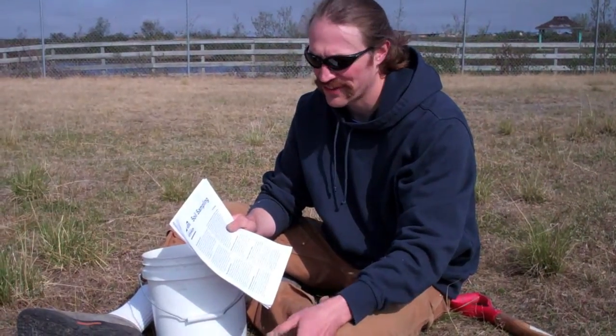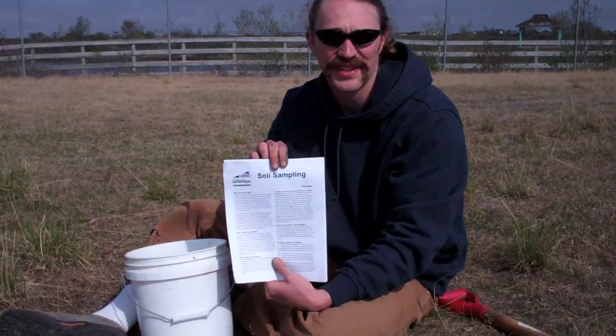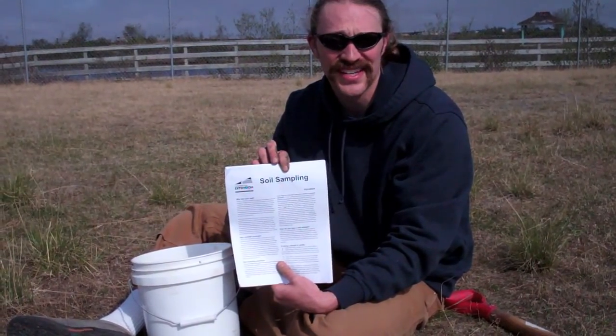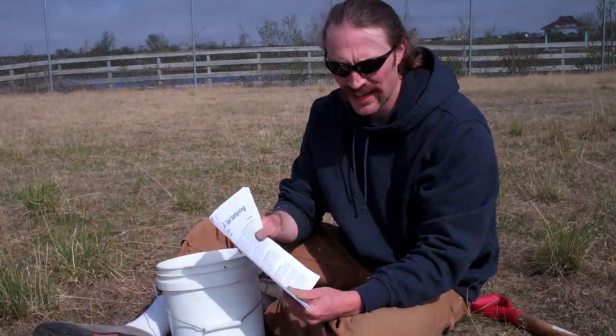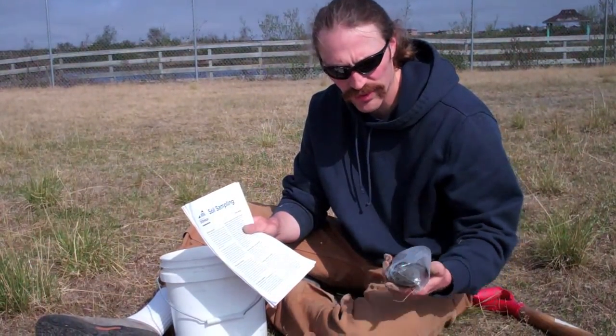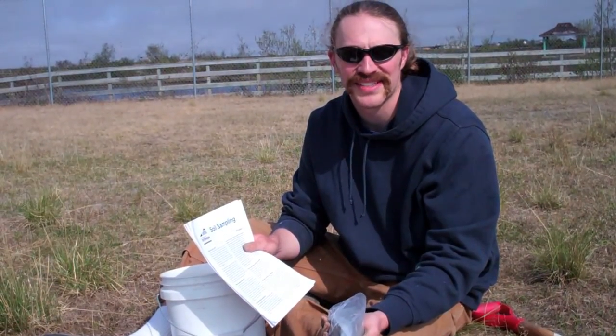A lot of the information that I got for this came straight out of our Cooperative Extension soil sampling publication. So if you can't remember it all, we've got this available online or from your local extension agent, and it lays it out pretty clearly. We're gonna head back to our office now, and what we're gonna need to do is dry this sample out.